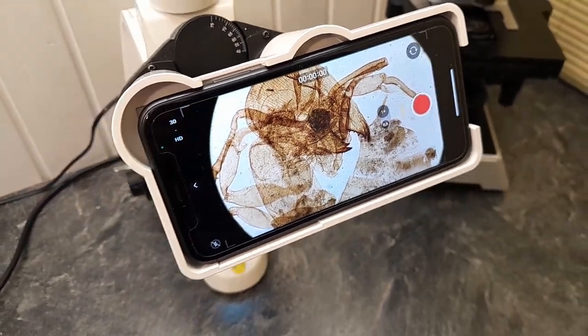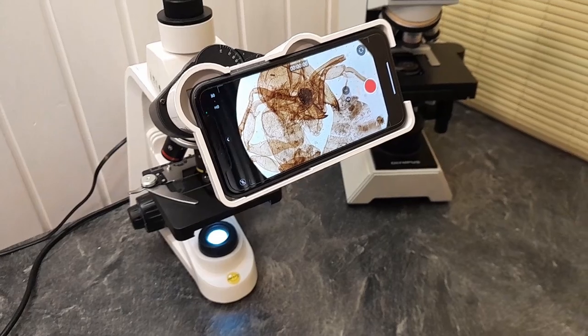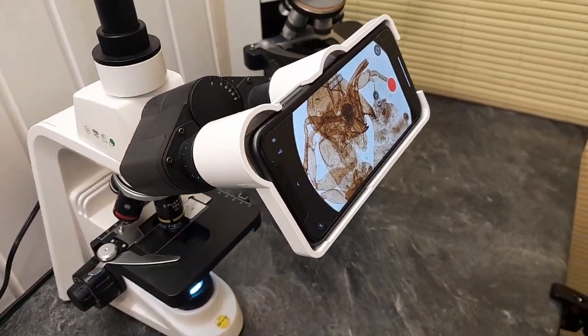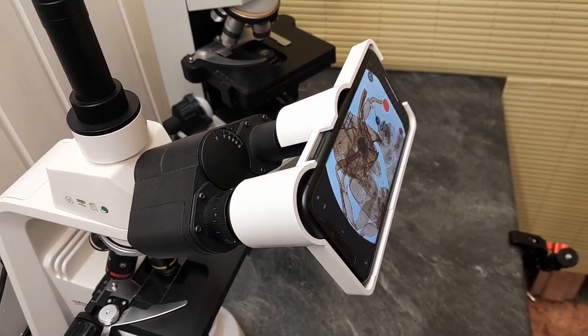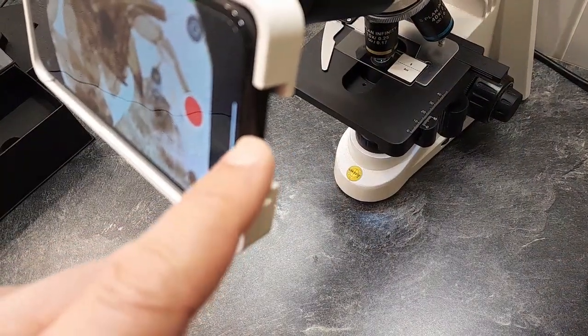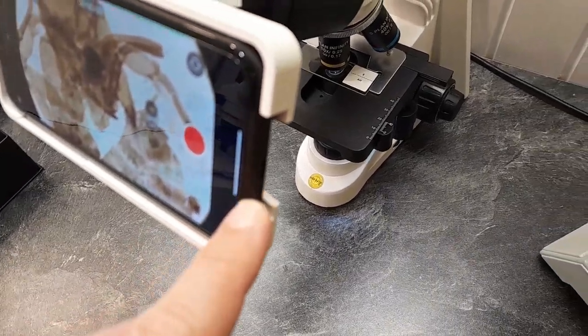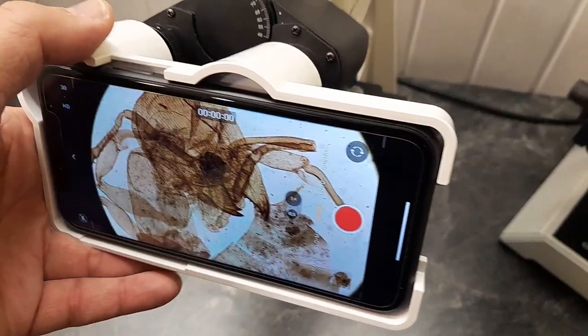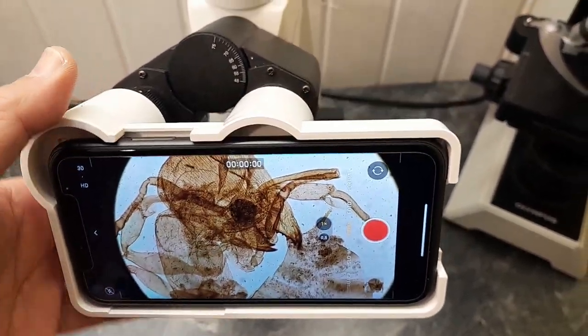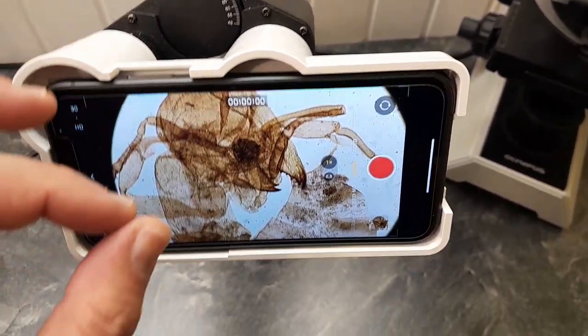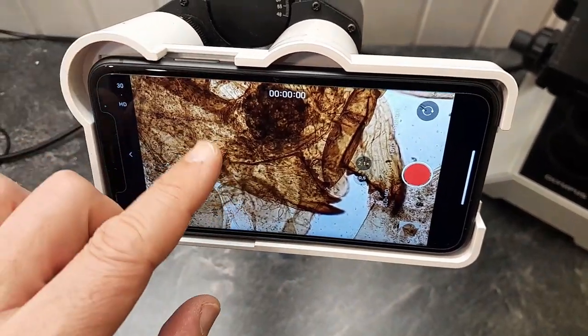So this is now the adapter fitted to a compound microscope here and the principle is of course pretty much the same and you can of course as you see here use the mobile phone also as a viewing screen. The controls of the mobile phone are easily accessible so you can see that the button of the mobile phone on the top is easily accessible. Of course you can also pinch and zoom to get different fields of view.